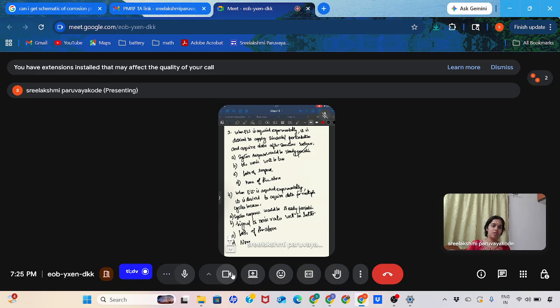Is it because the system response will be steady periodic? Whether you do a single cycle or multiple cycles, it will take some time to stabilize, so it has nothing to do with the stabilization. So the next option is signal to noise ratio is better. In the previous example I also said the noise is going to be the same irrespective of the time you give. Sometimes the noise can make the data look like this, next time it can be different, so when you average it over time, you can minimize the noise or it can give better confidence. That's why the signal to noise ratio will be better.